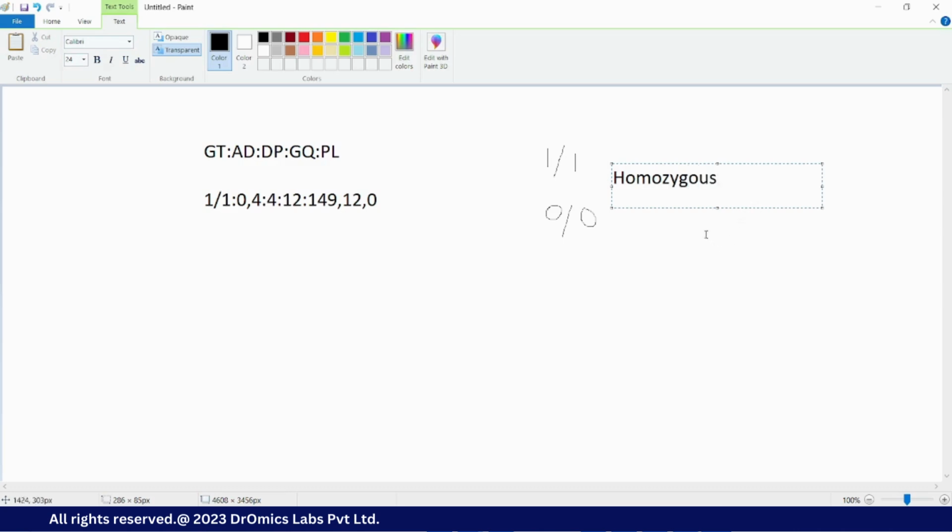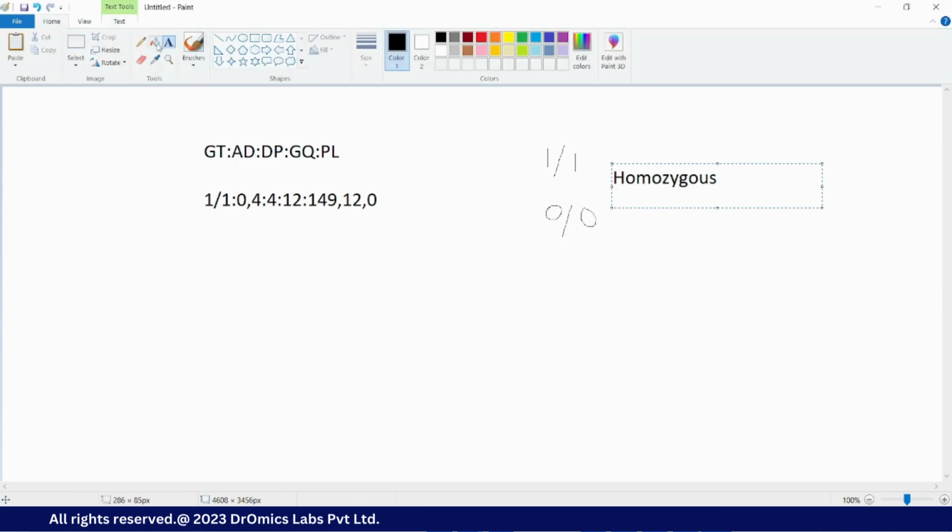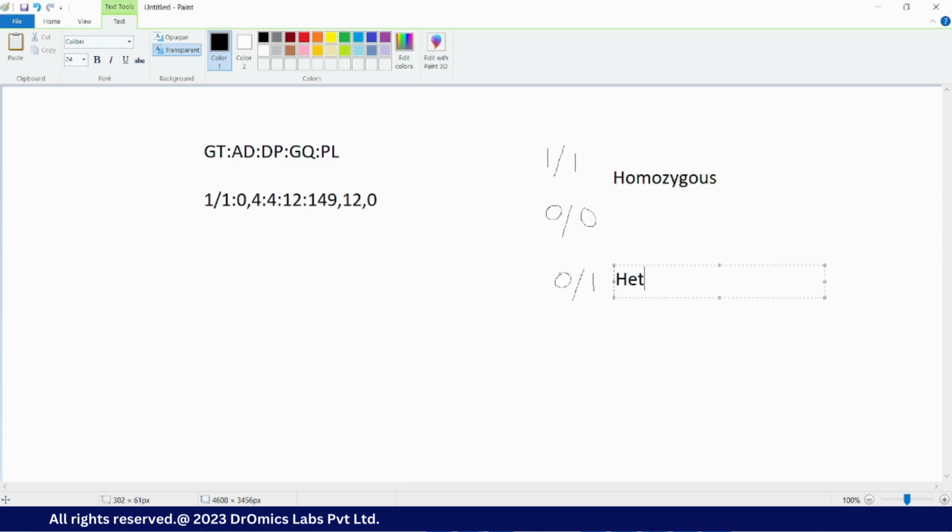But if you are receiving 0/1, at that time you can say it is heterozygous.